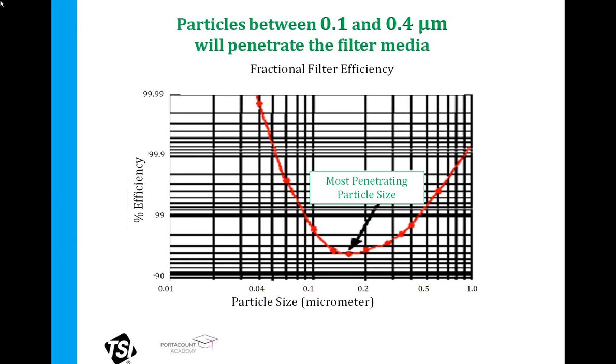Now the graph here shows the efficiency of filtration. We've got it listed from 90% up to 100%, and the line that you're looking at is the filter efficiency curve of a 95% efficient mask. You can see that at its lowest point, it is right about 95% efficient. But what I want you to notice is that right when you get down to 0.1 micron, the efficiency of this N95 mask is almost 99% efficient, and within no time, we're at 100% efficient.